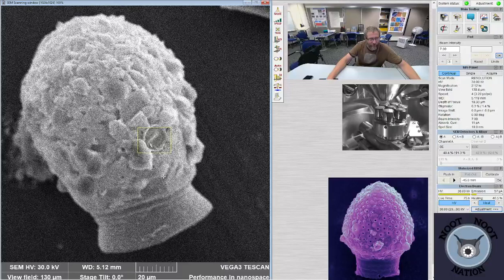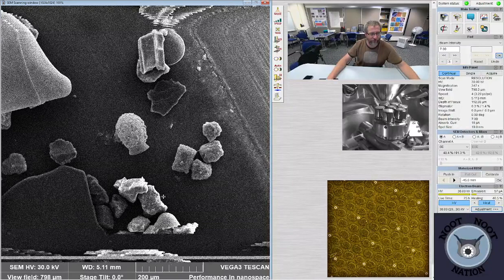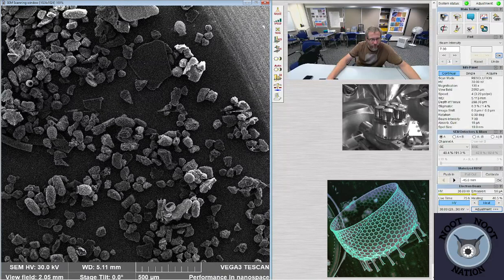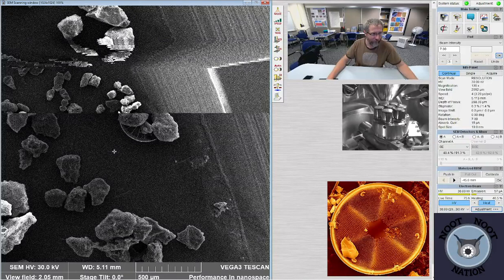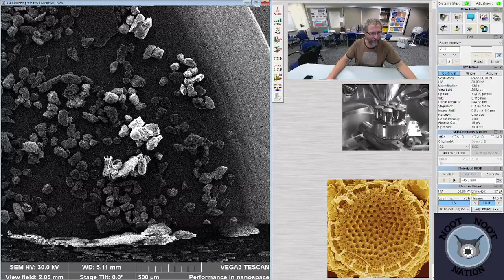Here's a tintinid, and that's a piece of a diatom frustule, a bit of diatom that it's welded into, or glued into its skeleton. There's an arachnodiscus, and I think part of the reason that Pacific Plankton sent me these samples is because we were looking to see if we could find some arachnodiscus in the SEM, and I think the sample actually had kind of a lot of arachnodiscus in it. So hopefully one of those, with a little bit of a clearer view, is going to be available on one of the other slides or stubs that I made.